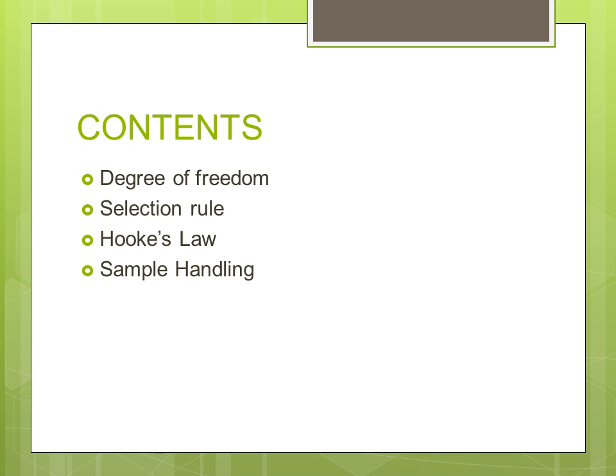So here are the contents of the current video. We will discuss the degrees of freedom, which tell us how many types of vibrations will be present in a molecule. We'll see the selection rule, which will tell us which vibrations result in the absorption of IR radiation and which vibrations don't absorb IR radiation.